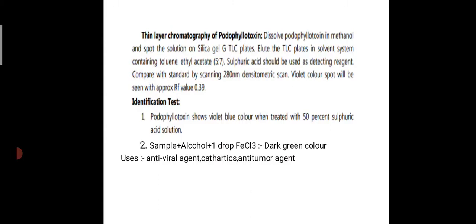Then the identification test used for podophyllotoxin: it shows violet blue color when treated with 50% sulfuric acid solution. To this podophyllotoxin, add 50% sulfuric acid. It shows violet blue color. It indicates the presence of podophyllotoxin.